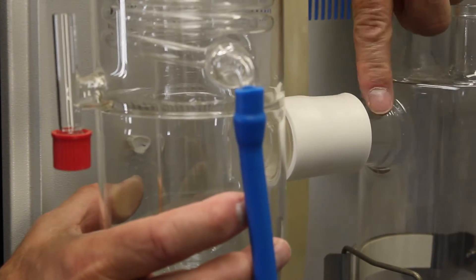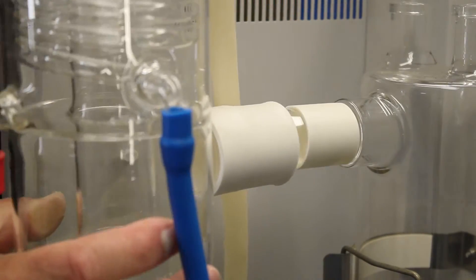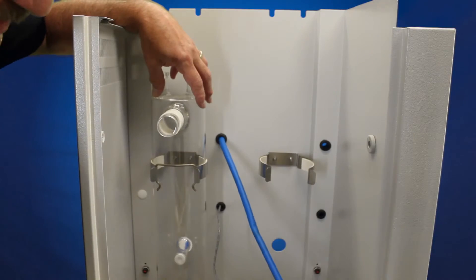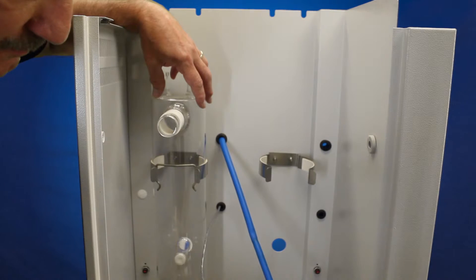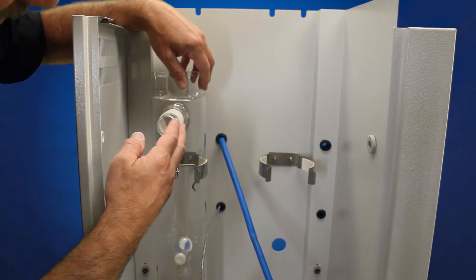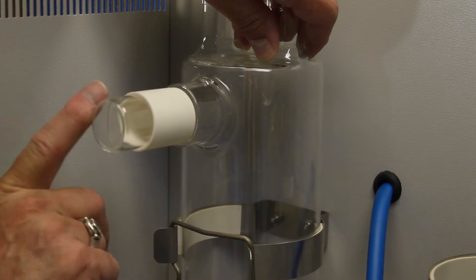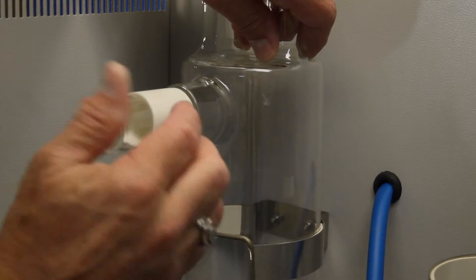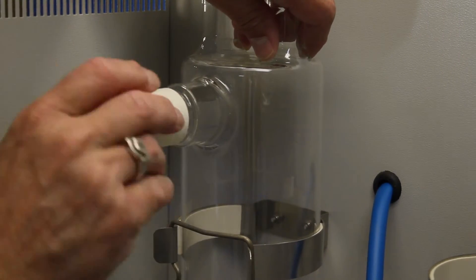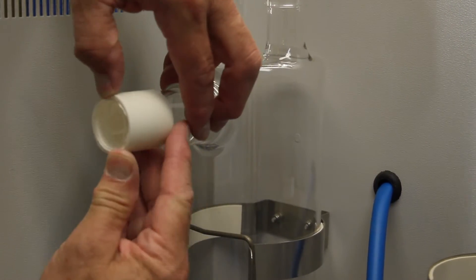We're going to take the condenser, slide it gently out. We can set that aside. And now we've got access to our boiler. The outer sleeve, which was connected to the condenser, this is our inner sleeve. Now when we get the new boiler, you're going to get this inner sleeve and the outer sleeve.